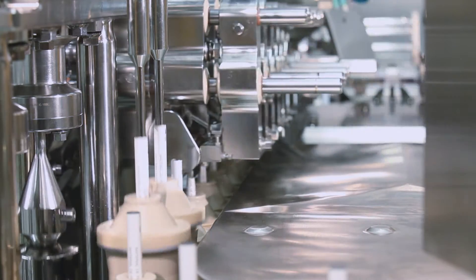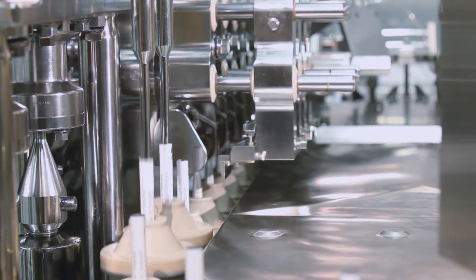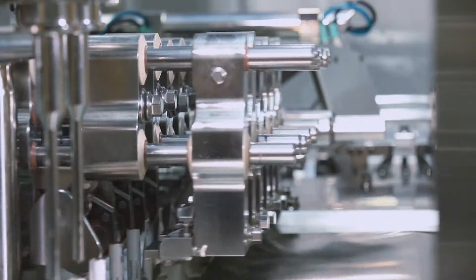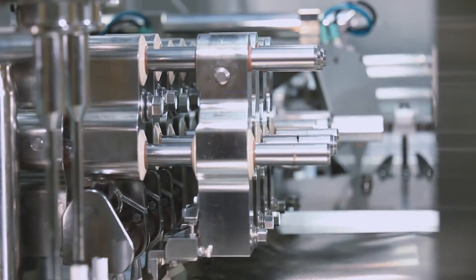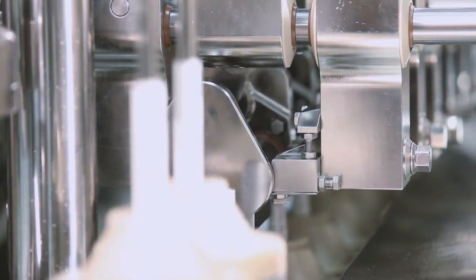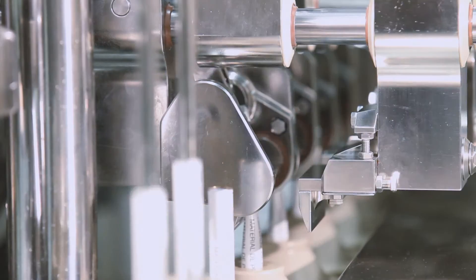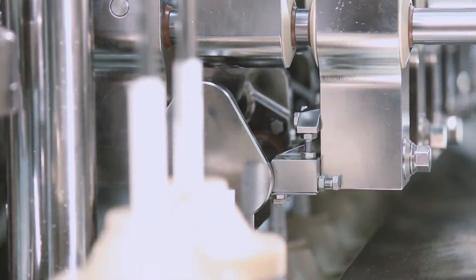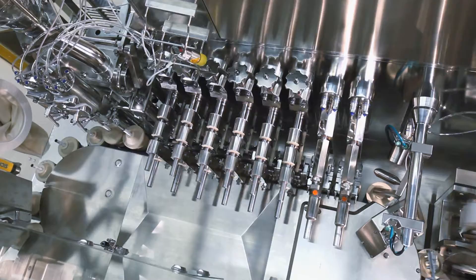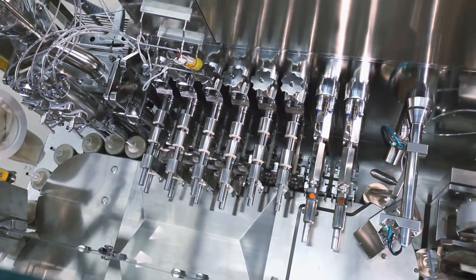In the filling station, two tubes are lifted towards the filling nozzle at the same time. Servo-driven bottom-up filling ensures a perfect fill result at a maximum output of 220 tubes per minute. Due to the modular concept of the IWK FP sterile tube filling series, multiple sealing stations such as metal or hot air closure can be mounted on the machine. There is no need to change stations when switching from metal to plastic or laminate tubes.